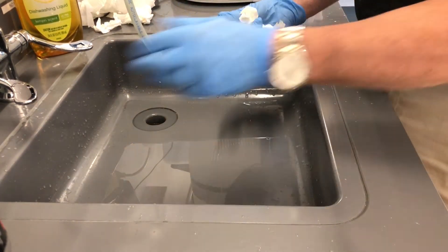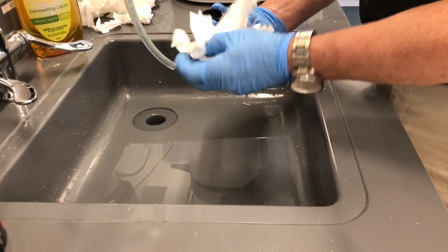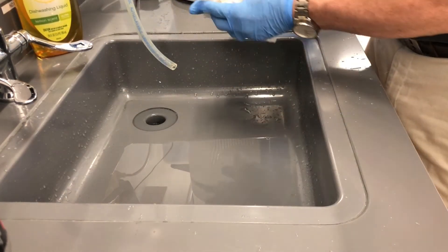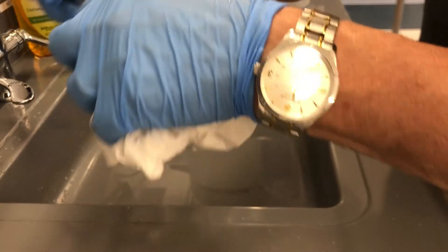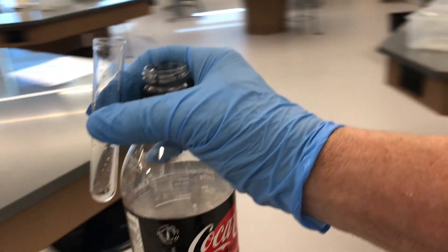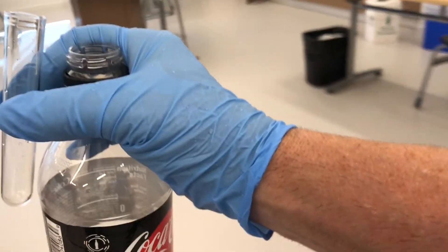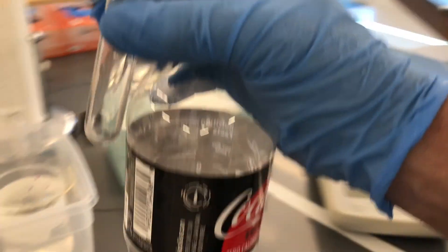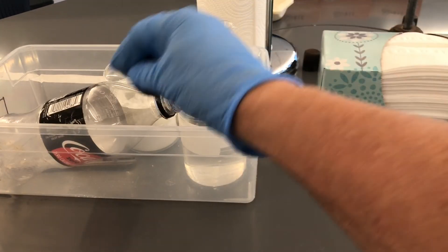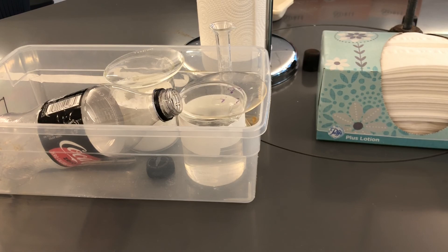Now I'm going to dry the cap. I've been a good citizen — got it all dried off on the outside. I'm going to take this stuff back to the table and put everything back in the bin: the test tube, the bottle, and the cap. And now we are done with the experiment.